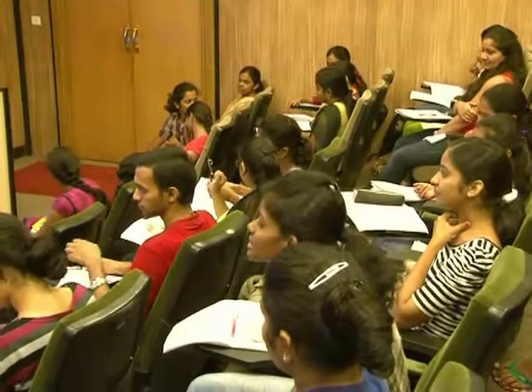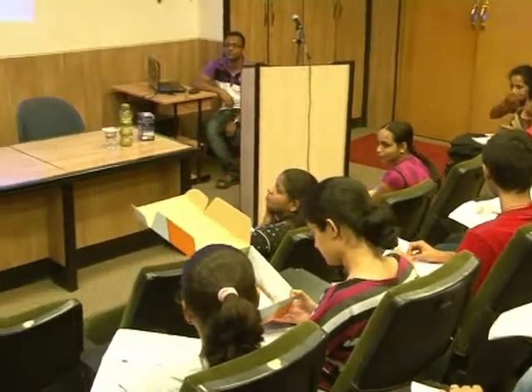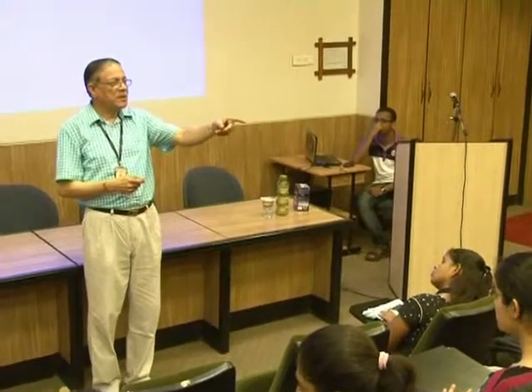See the relative difference in the diameter, and one advantage of capillary column is that you can have a capillary column of minimum 25 to 30 meters to 100 meters or maybe 150 meters because it's a small coil. This is also a coil, but it's a bigger coil, and so the length of the packed column normally is not more than 1 meter in the form of a coil. This may be 2 meters, but not more than that.